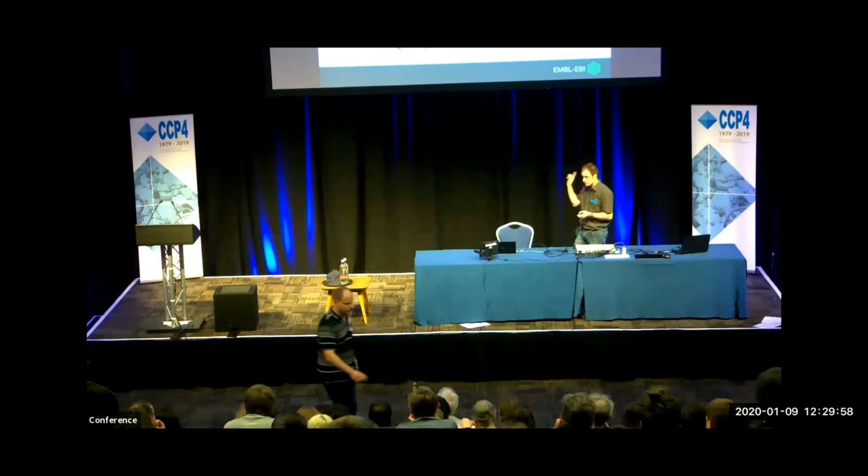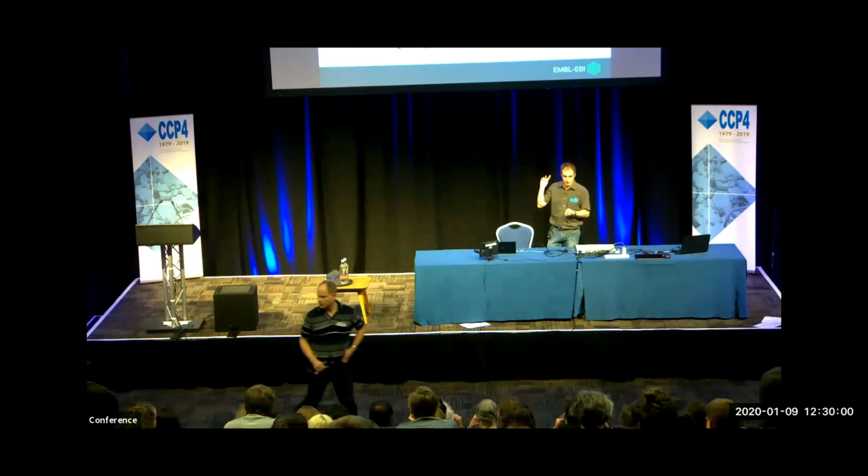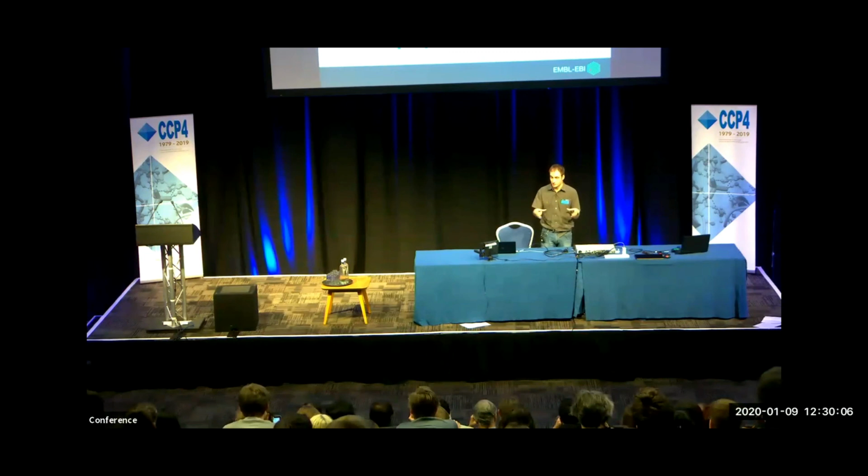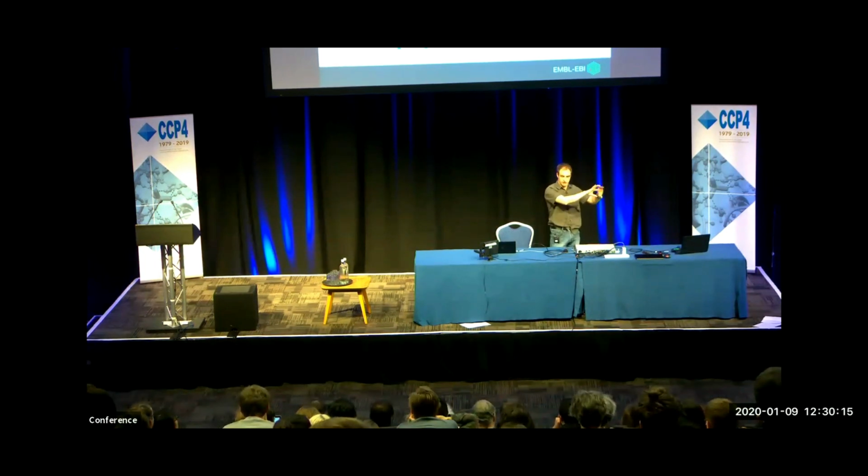There are extensions to the mmCIF dictionary that have tried to address this. There's a service of PDB-Dev that has an extension to the dictionary that allows more hybrid methods to be described, so they're not purely at the atomic level. You can define a blob, a big sphere. So this blob is that protein.